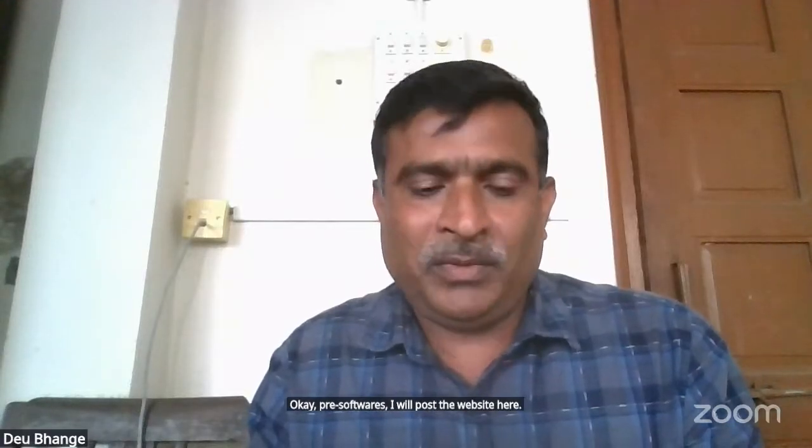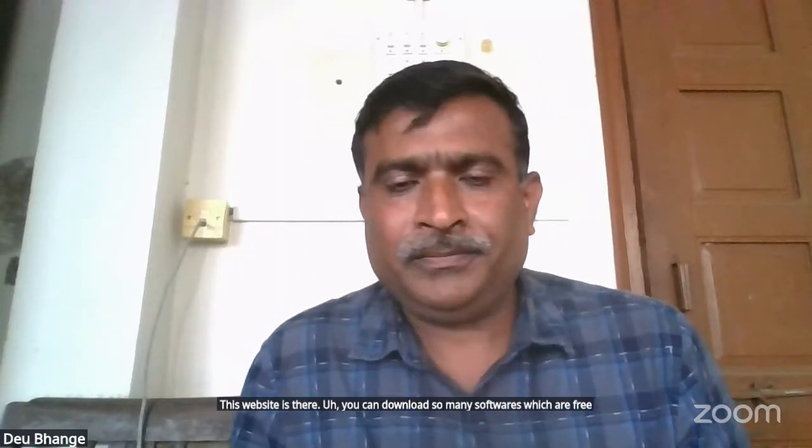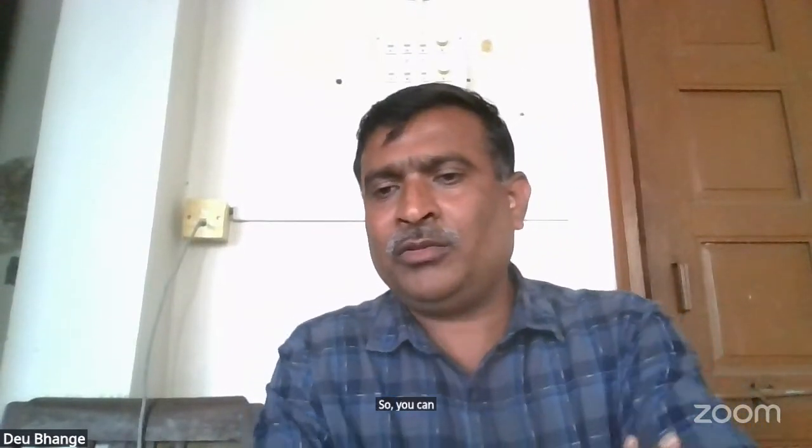Okay, free software, I will post the website here: ccp14.ac.uk. This website is there. You can download so many softwares which are free of cost. But for XRD, GSAS, then Mercury and VESTA are more than enough. Then EXPO2014 is there, that is from University of Bari. So you can download and use those.